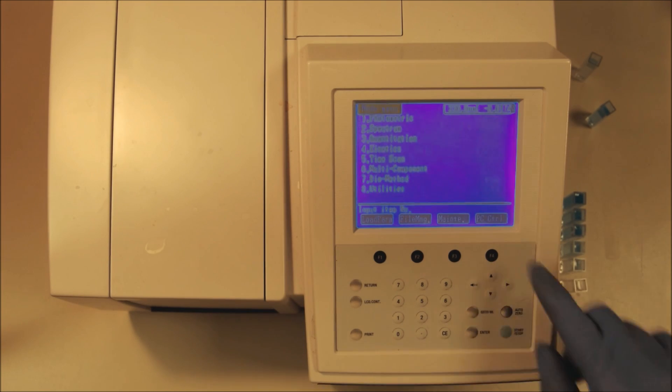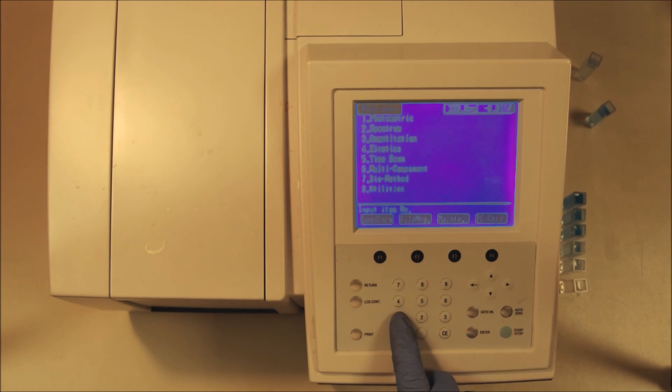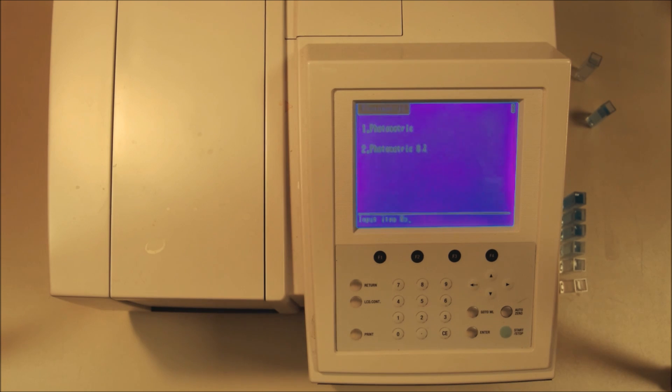Now let's look at the spectrometer. The first thing we're going to do with the spectrometer is set up the method that we wish to use. We want to do photometry at a single wavelength so we set the first option and then the first option again and we're doing single wavelength measurements.